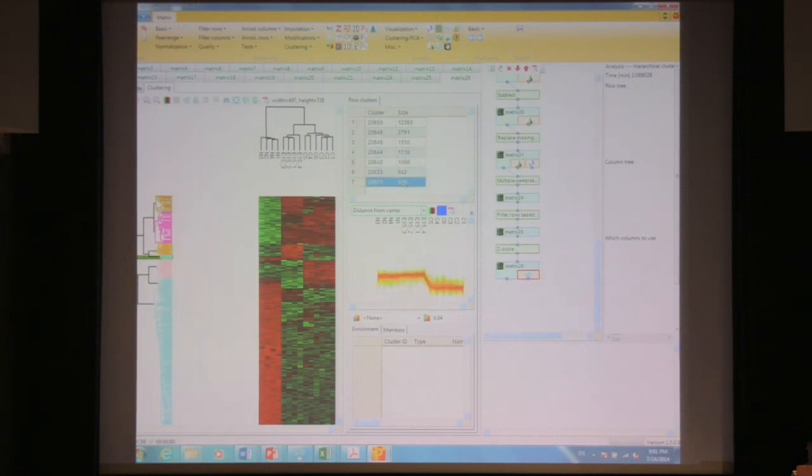Now, since it's phospho data, with any data we can check the enrichment here, just like with a Fisher exact test. But it's important for phospho data that we use this relative enrichment tool. This is specific to phospho because we added protein annotations, but now we're checking if there's a site-specific enrichment.